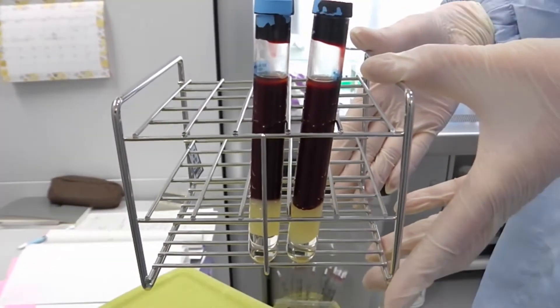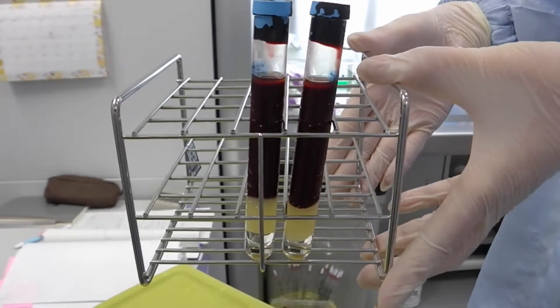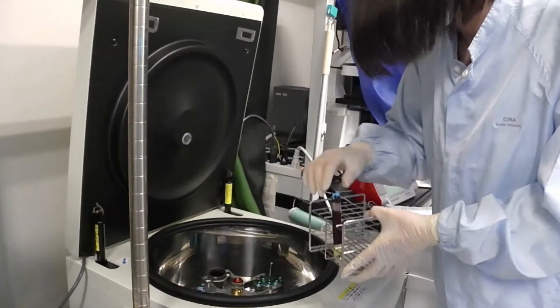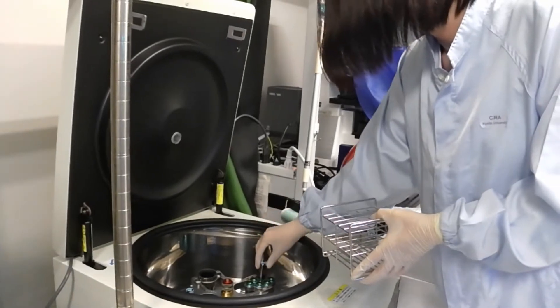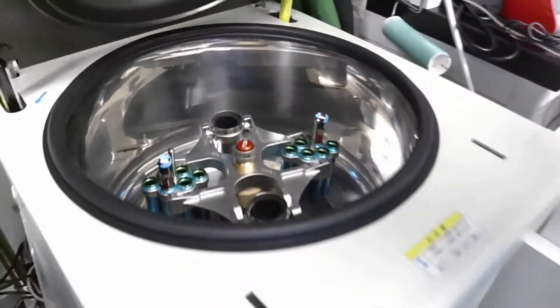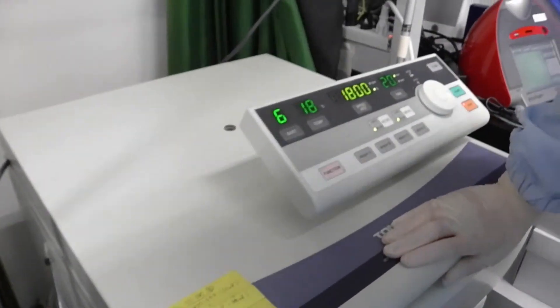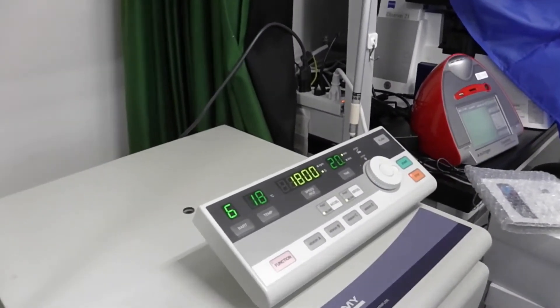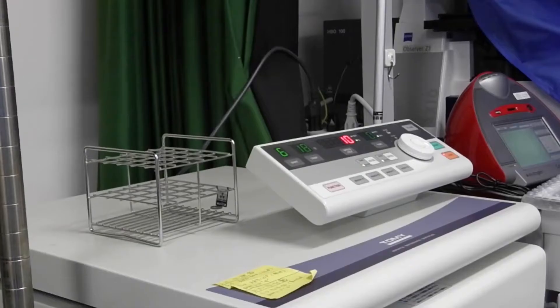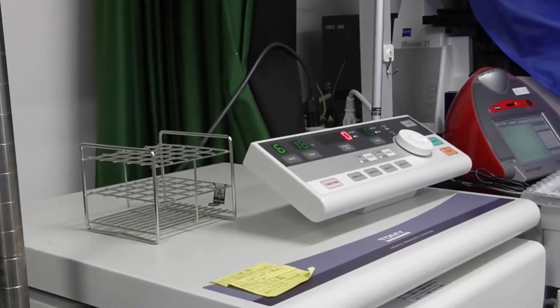The blood sample is collected into a vacutainer CPT2 purchased from Becton Dickinson and company. After gently mixing by inverting 8 to 10 times at room temperature, the blood sample is centrifuged at 1800 g for 20 minutes. Acceleration and deceleration modes are set to slow.